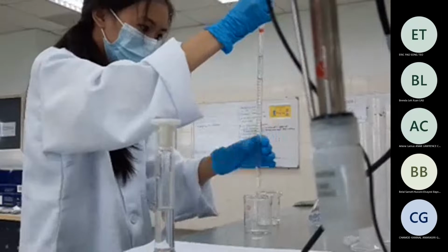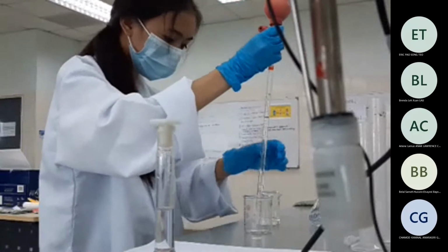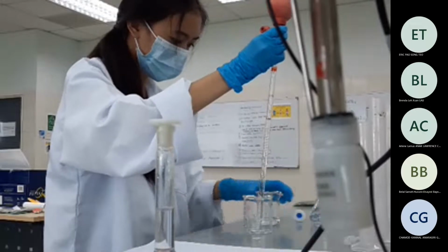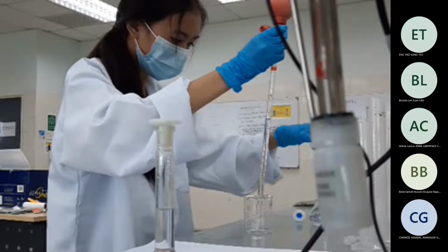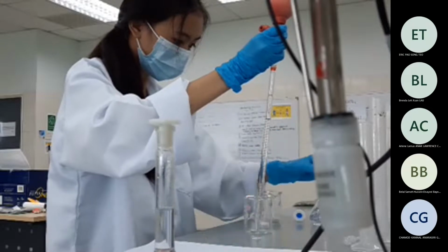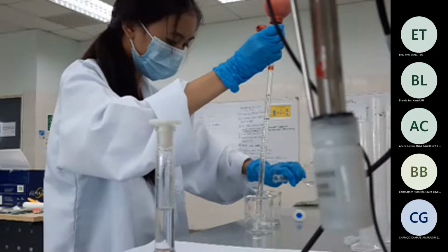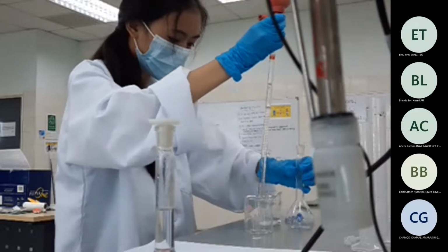Yep. Few drops more. 1, 2, another one. Yeah, enough. No, another one more drop. One more drop. Yep, good. So now give a gentle shake.